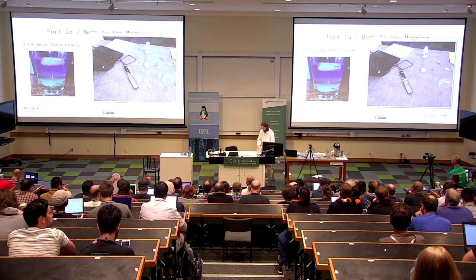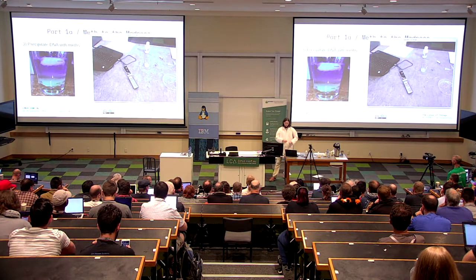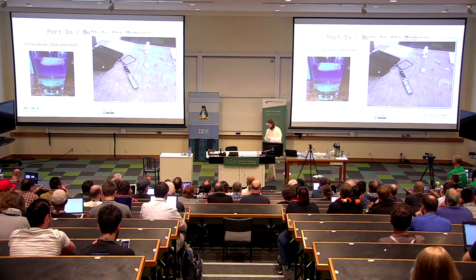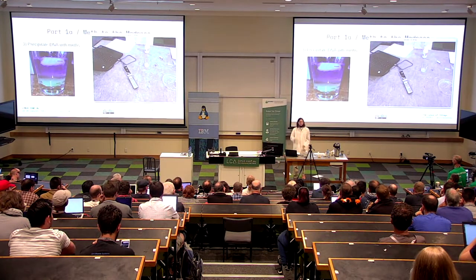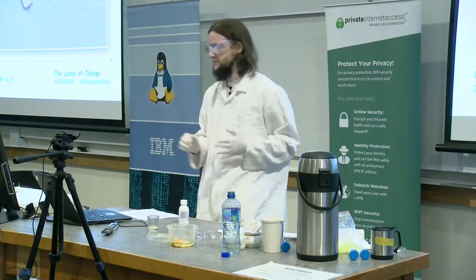I've also got some gloves. These were also bought from a pharmacy, just in case anyone wants to buy some of those, if they want to do some extraction themselves. And I do have glasses on, but I decided just to be safe, I'd have another pair.